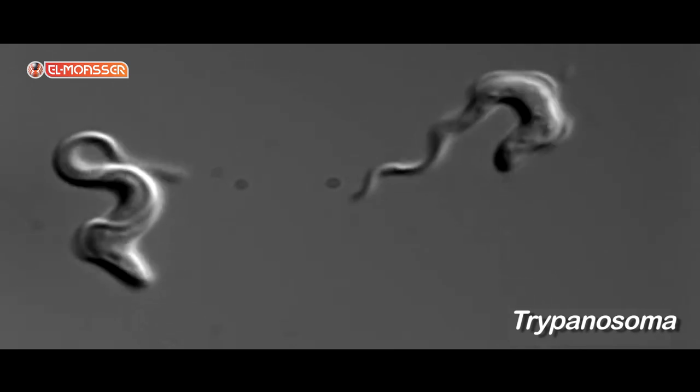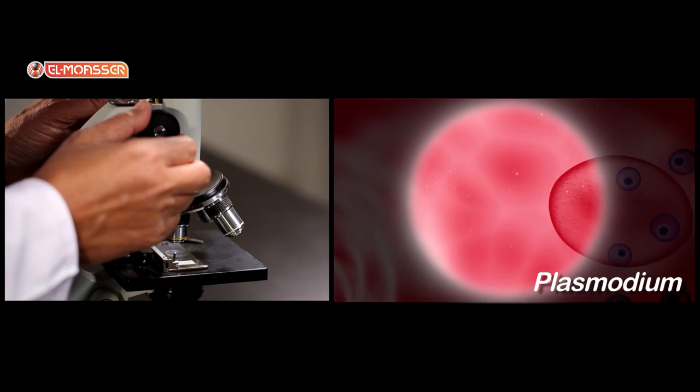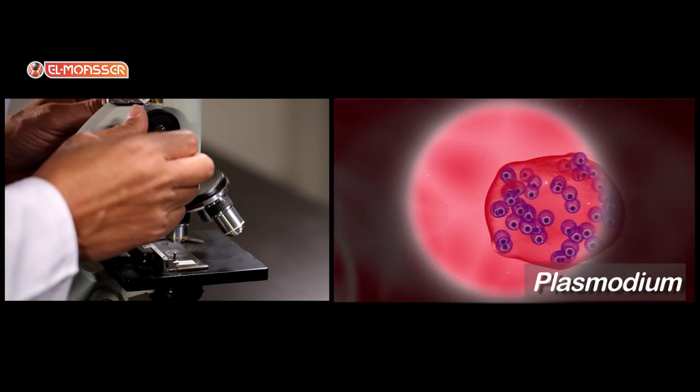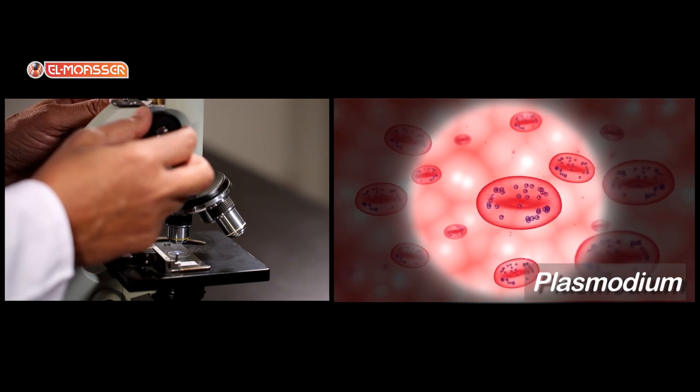Trypanosoma moves by flagella and causes sleeping sickness in humans. Plasmodium has no means of locomotion and causes the malaria disease.